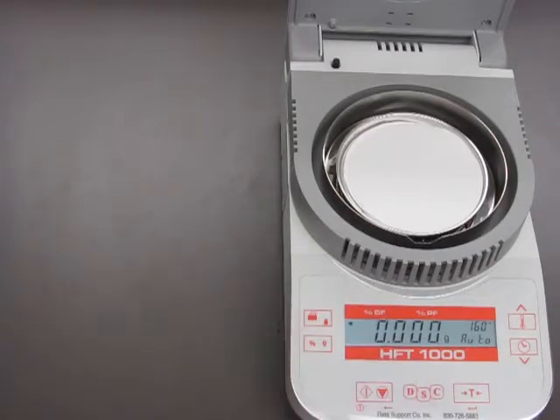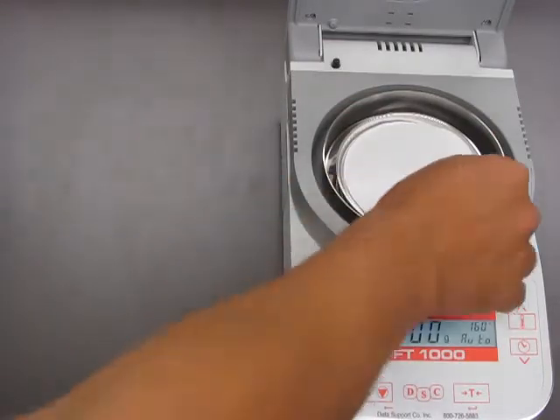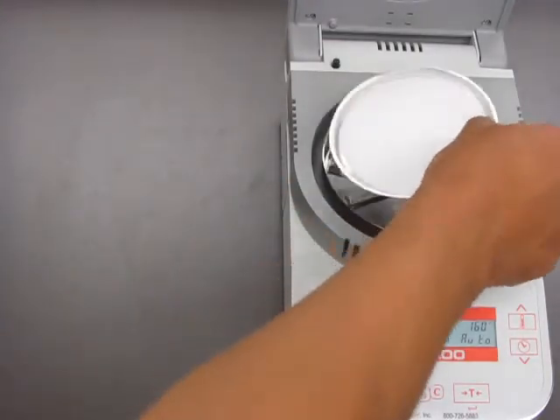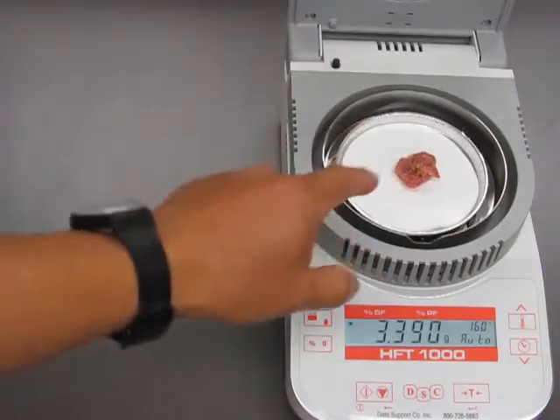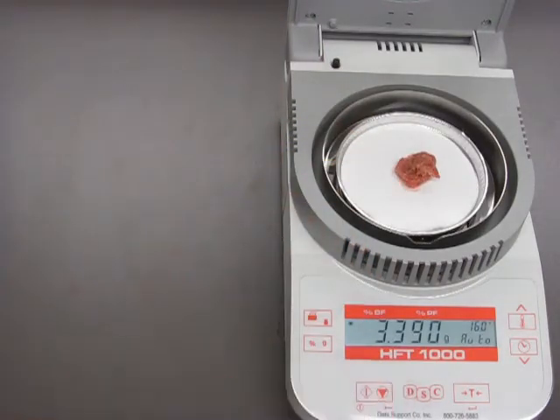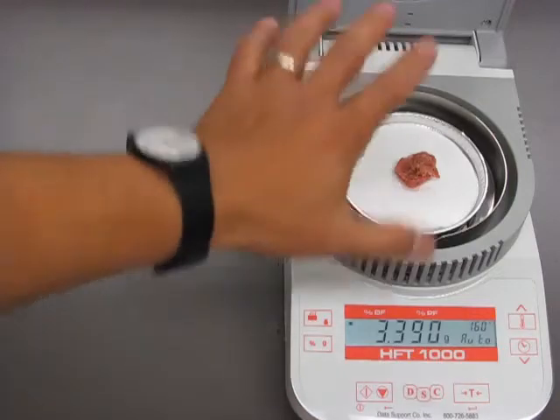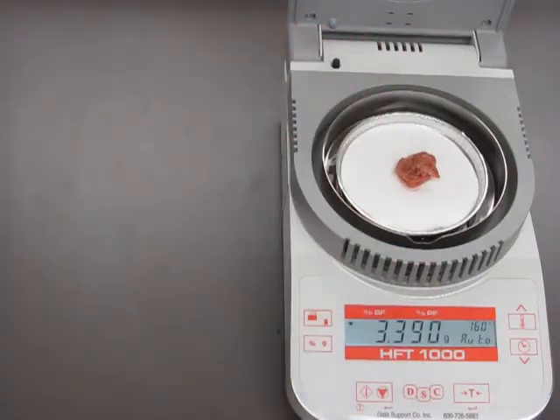Once you have zeroed out the reading, you place your sample on the top of the pad. So I already prepared something here. You will see your target is about three to four grams of sample. So that's how it would look like once you have the right sample size.